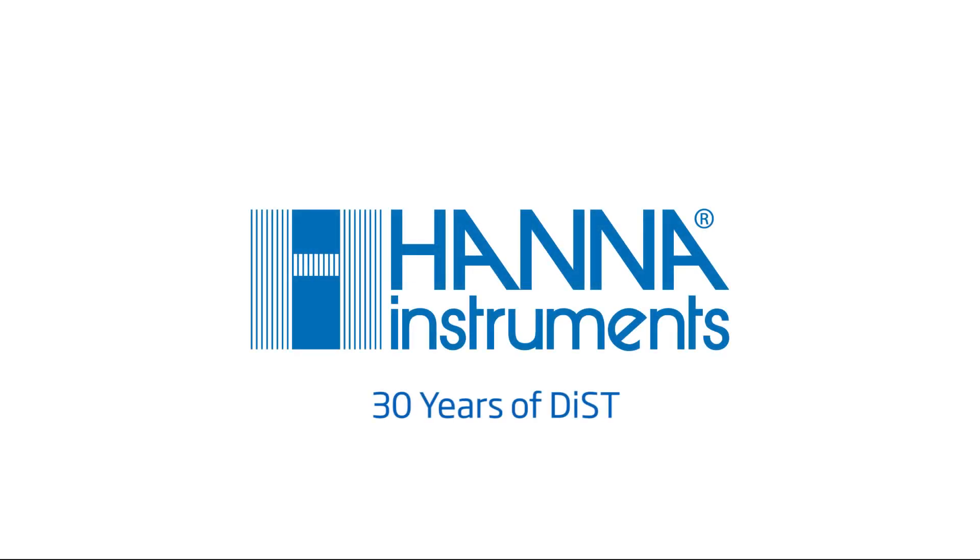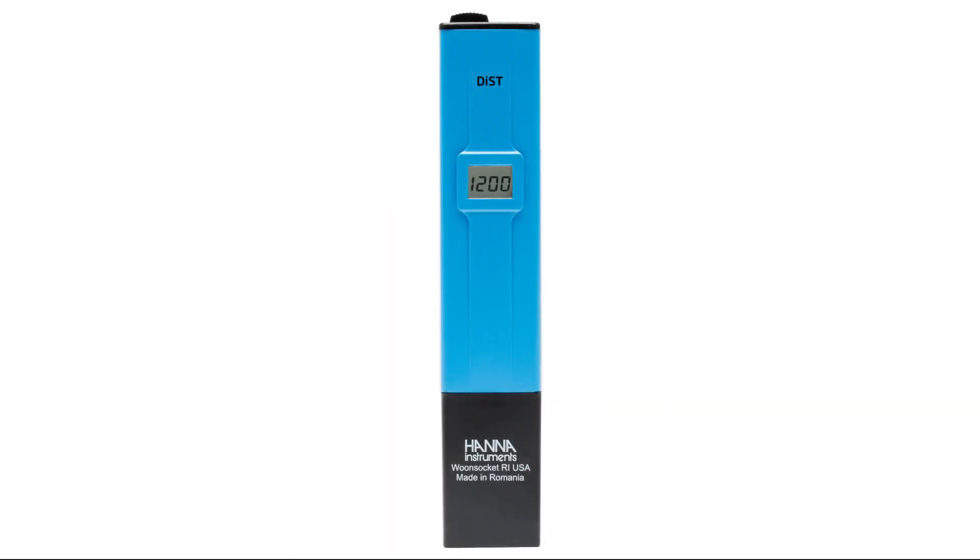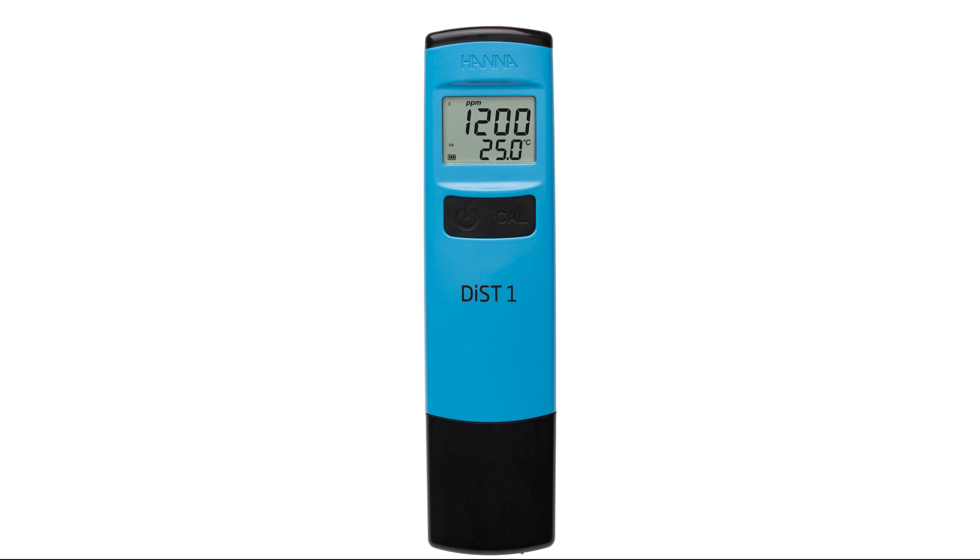In 1986, the DIST family of pocket meters revolutionized conductivity and TDS measurement by providing an affordable and easy-to-use conductivity meter. 30 years later, we introduce you to our latest generation of handheld testers, the DIST family.